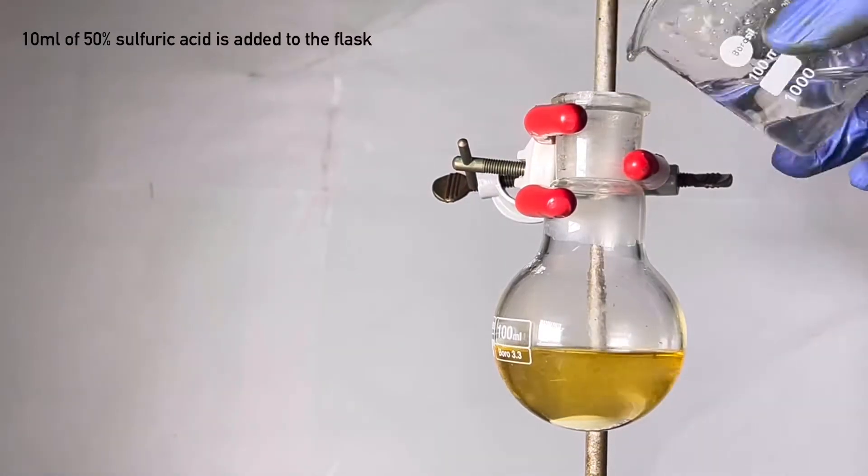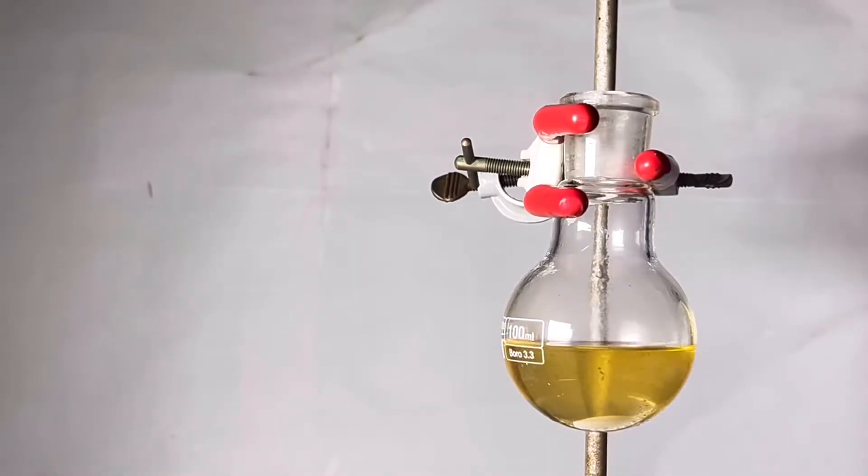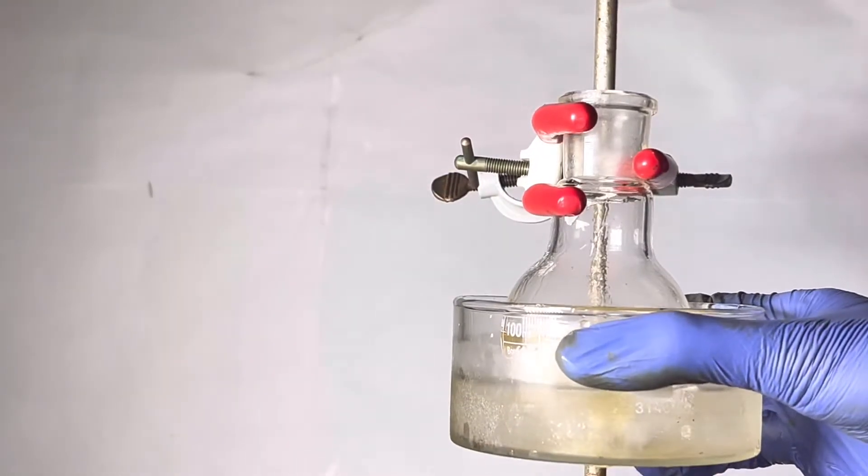Next, we will slowly add 10 milliliters of 50% sulfuric acid. If the temperature becomes very high, an ice bath could be used to bring the temperature down.